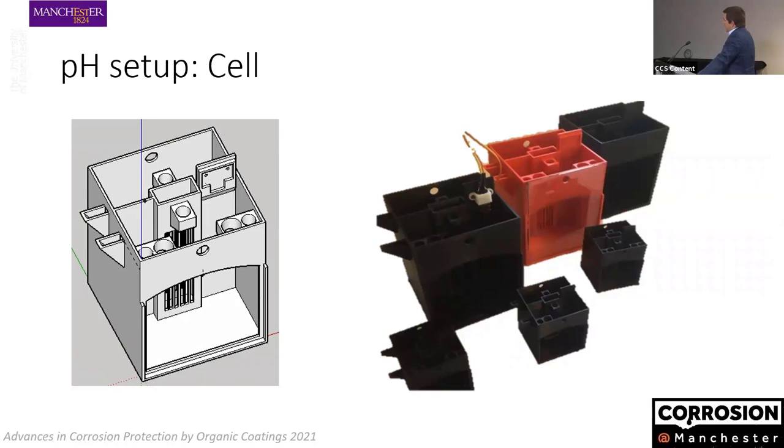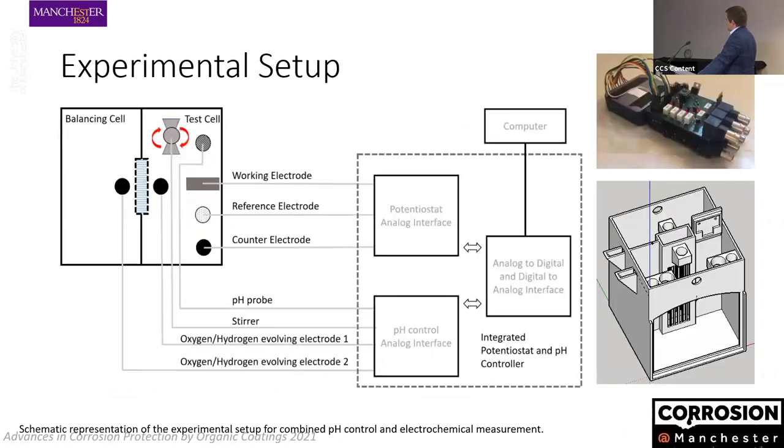We then made a specific cell — a 3D-printed cell. You can see the two portions of the electrochemical cell, a separator where we place the porous material (basically a plastic sponge), housing for the stirrer, and places to put the various electrodes and carry out measurements. The whole assembly connects the cell where we perform the experiment to the analog and digital part of the circuit that controls the pH and measures the electrochemical response.